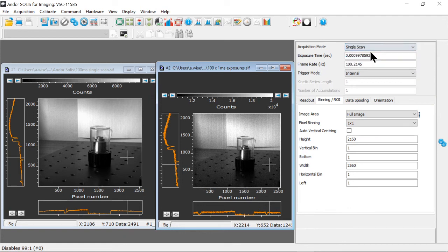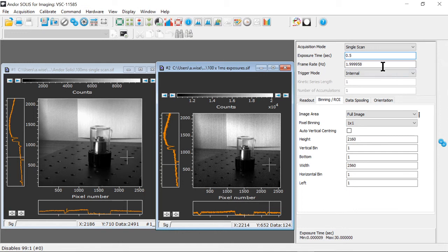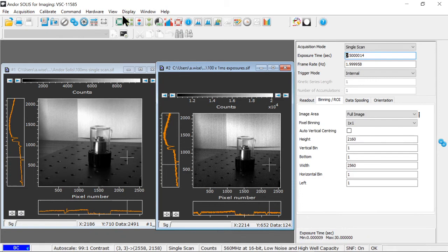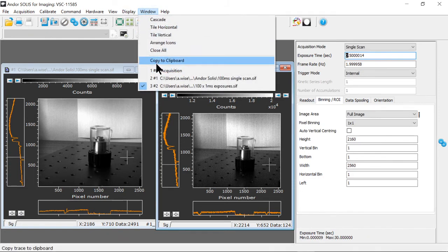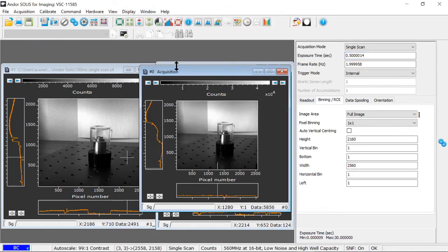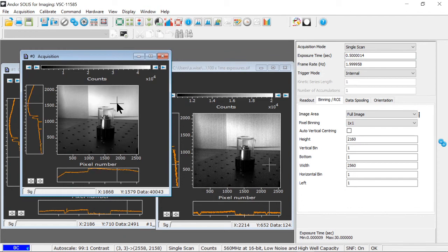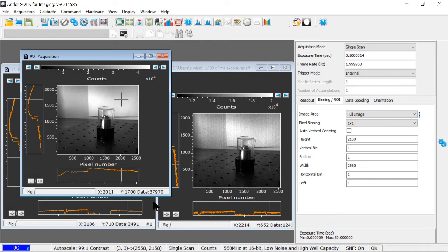So if I go back to single scan and say I did an exposure time of 100 milliseconds, or 500 milliseconds maybe, to make it interesting, I'm going to take one image. And here's my new acquisition. So I'm already creeping up quite a bit towards saturation of the ADC here, the analog-to-digital converter. You can see I have about 40,000, 30,000 to 40,000 counts.